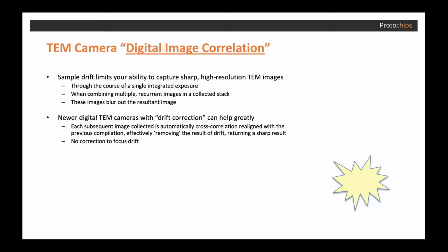So while this technique allows for a small amount of lateral image movement to be erased from the final photo or movie clip, it only works in the X and Y plane. Changes in the Z plane, which affect focus, cannot be addressed in this way.